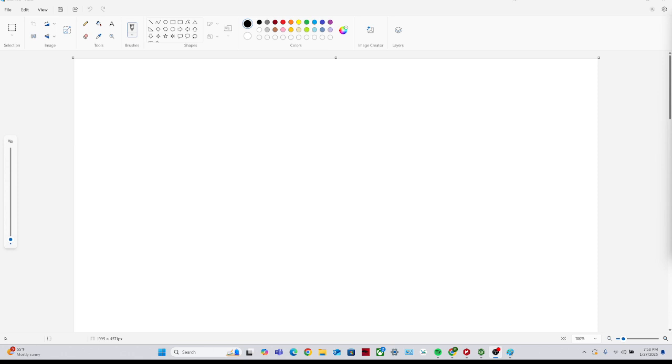Hello everyone. This is a really quick video on how to assign aromatic protons when you're dealing with benzylic derivatives. This is for Chem 143b, Experiment 1A or Experiment 1D. From my understanding, it's everyone's intro to NMR, and I can get why, having not done NMR and looking at a real spectra, it can be a little bit daunting. It's totally valid, but hopefully this video can clear up some confusion.